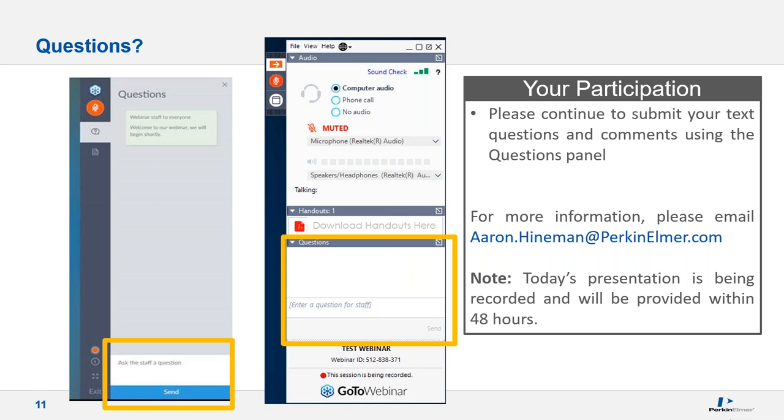All right, so here's a new one. Are there any special sample introduction conditions required for the metallurgical work, like the nickel alloy example you showed? In that case, there weren't. We used just the standard nebulizer, spray chamber, and injector that came with the instrument. In that case, we were using an AVIO 200.